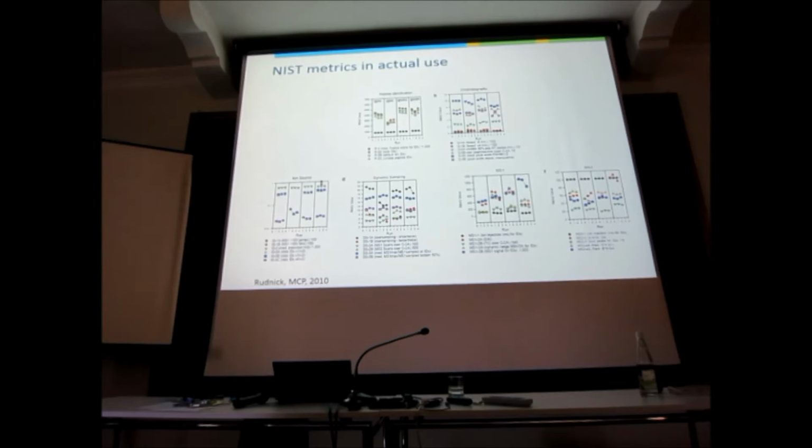These guys with few identifications, they have a problem with the charge ratios. So everybody else has a lot of this is the median m over z of the precursor, it's something else. This is the ratio of 3 plus versus 2 plus, and this is the ratio of 4 plus versus 2 plus. So you see that these ratios drop. So something went wrong in the ionization. That's why they can't identify so much. So you've not only seen a problem that is consistent and hampering all runs, you've also diagnosed the reason.